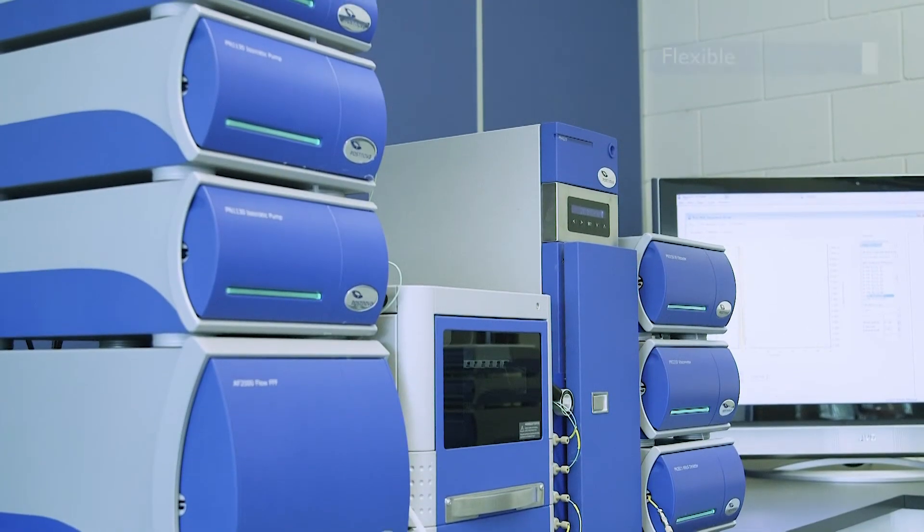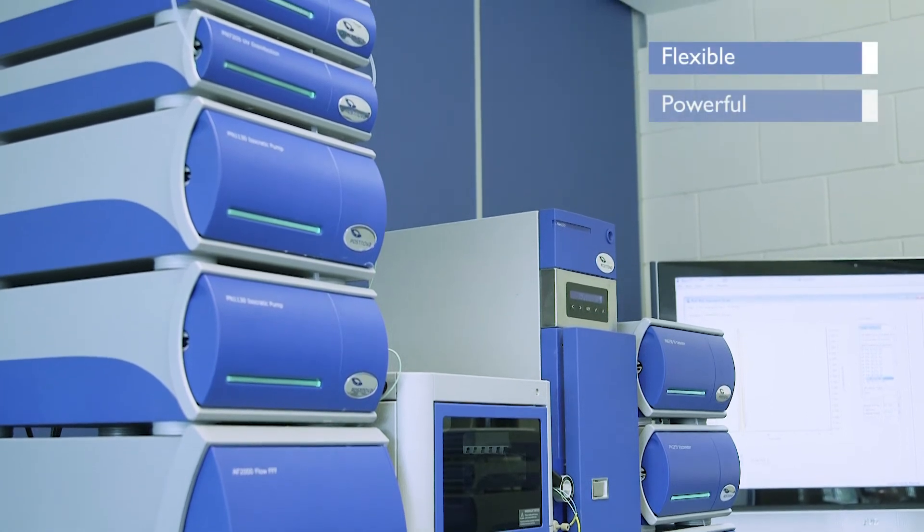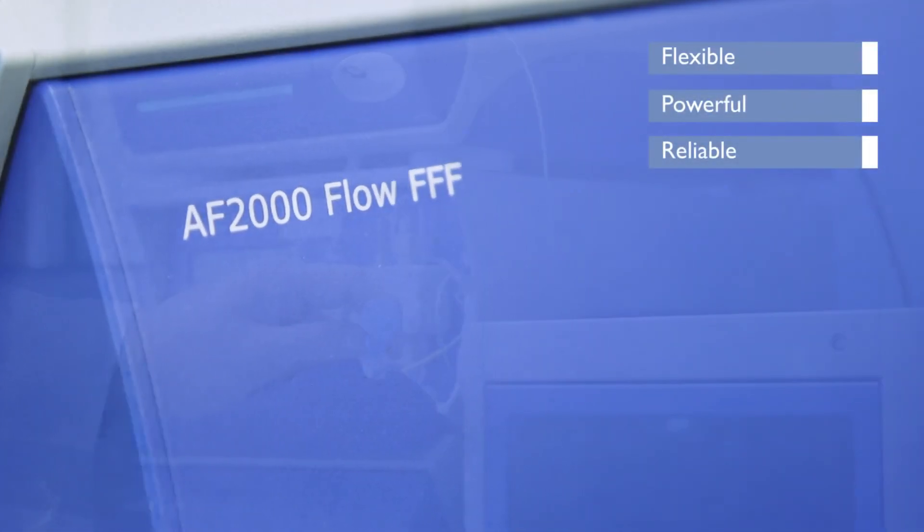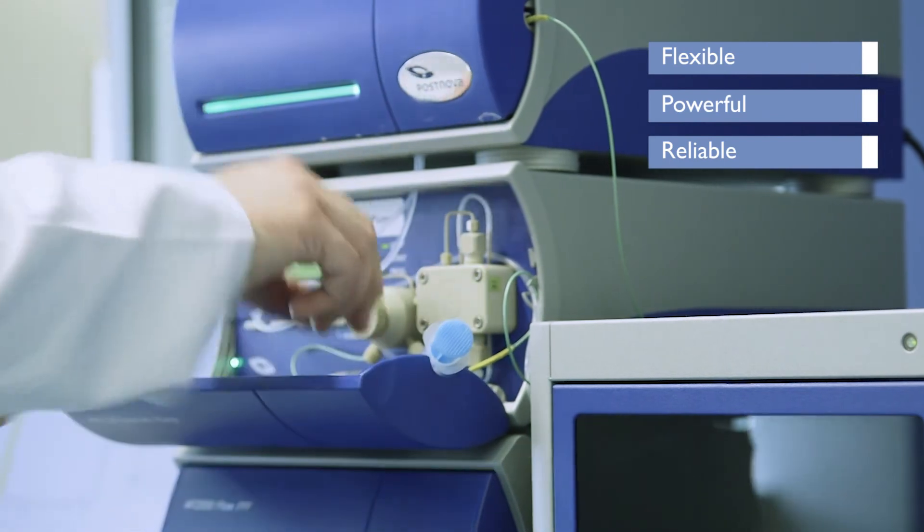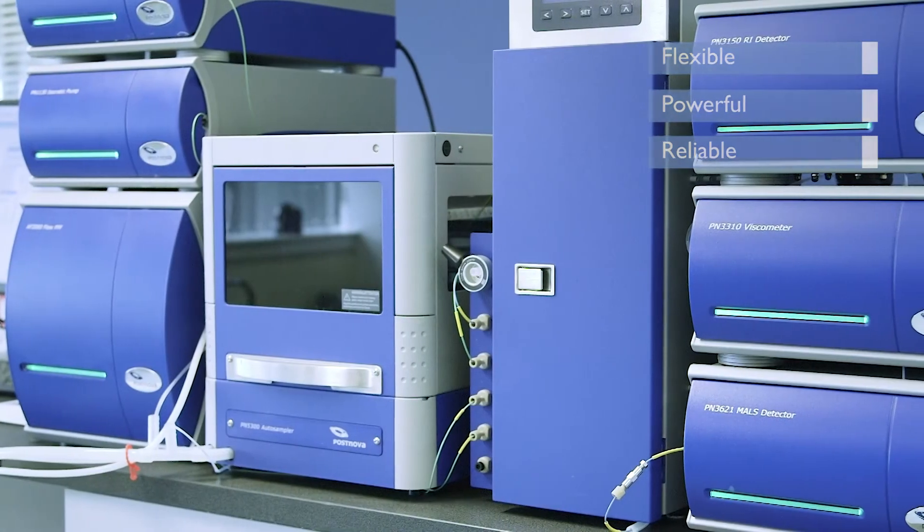The unique Postnova AF2000 system advances your research by allowing you to analyze the most complex protein, particles or polymer samples that you could not do before. Contact us for a demonstration today.